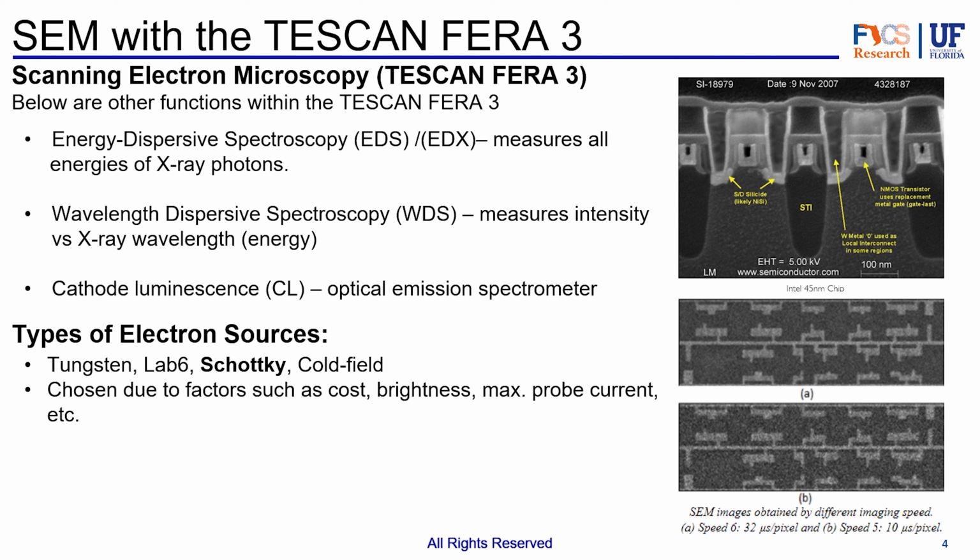There's actually different types of electron sources that are used in SEMs. Specifically, this one uses Schottky. It's just because of the factors such as cost and brightness, and even probe current.